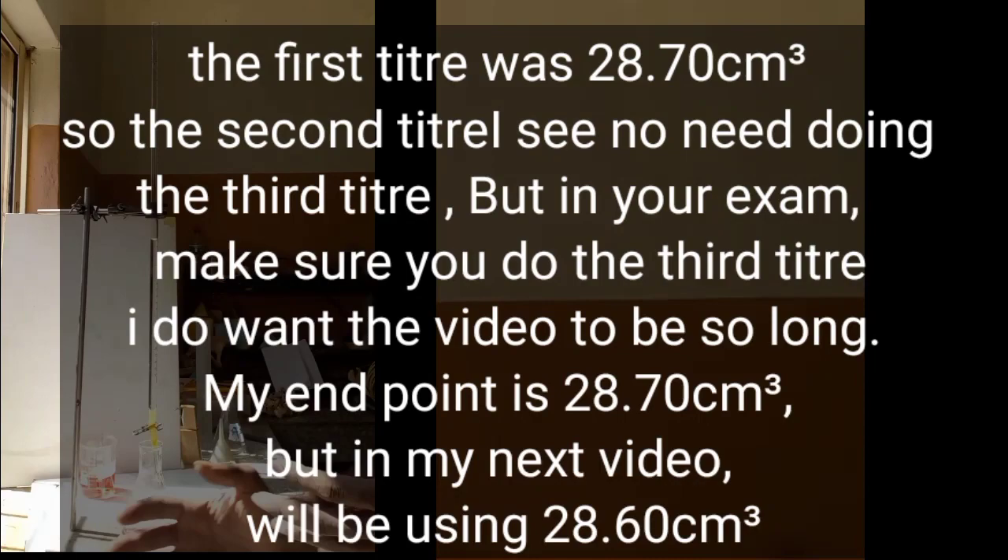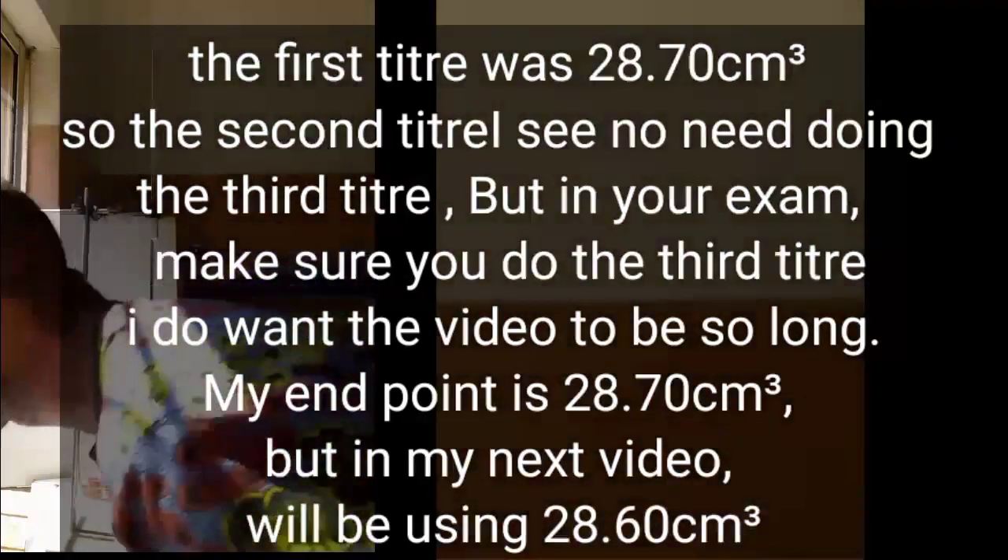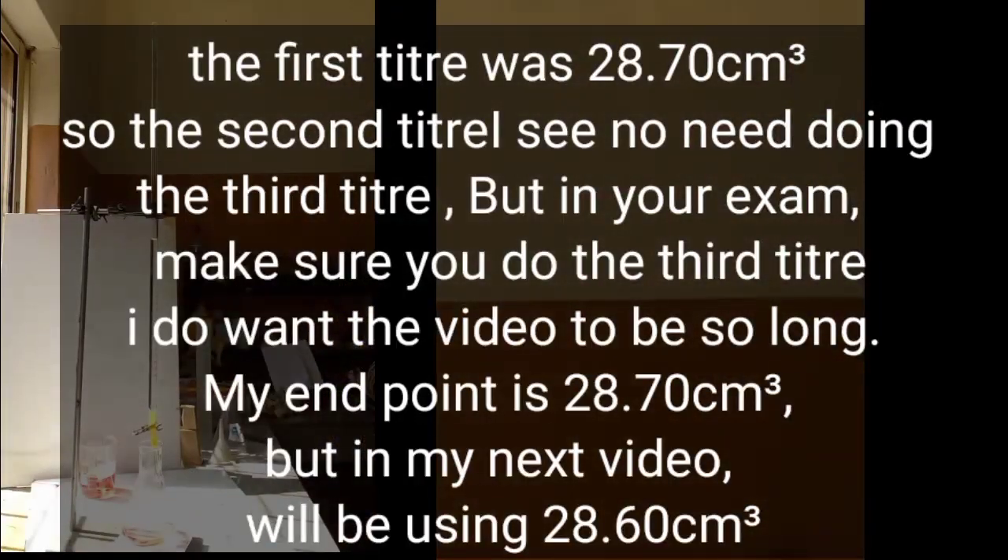Now, if you are a student doing this practical, there is no need for manipulation of values. As you can see in my own work, all you need to do — the first one you do — you should be very, very careful. When you are very careful, at a particular point, as you saw me counting at 27, you can use that to gauge your reading. It is very, very important. That will help you in your work.